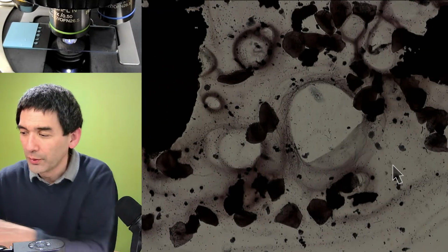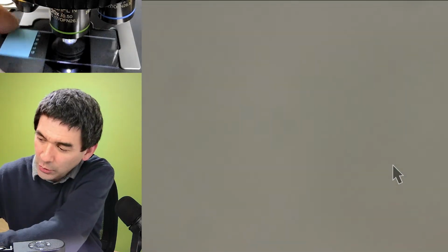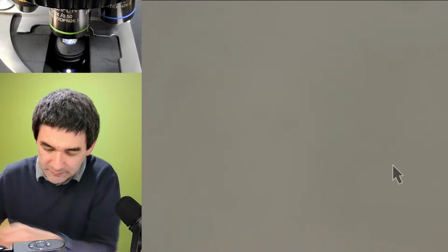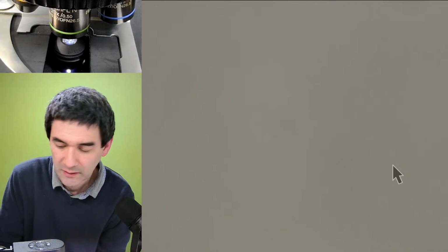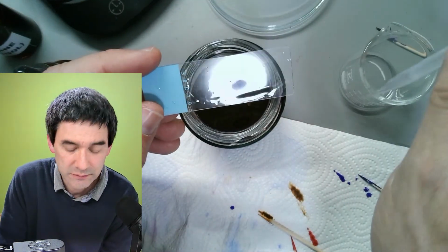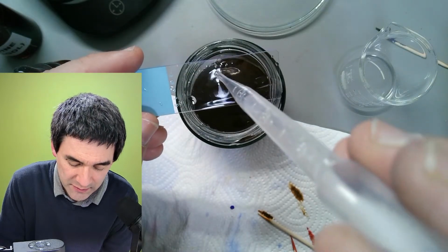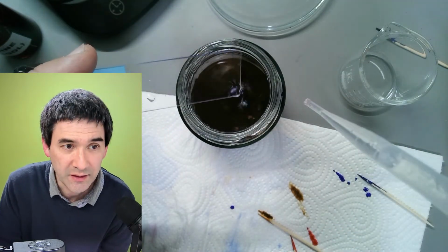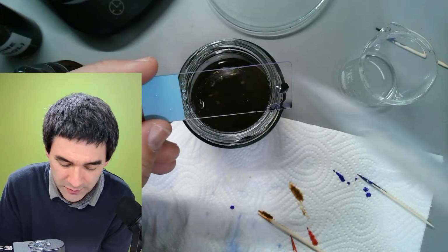Now we're going to start the de-staining by adding the alcohol. I always forget to change the camera. So let's do the same thing again here. Let's try to de-stain. You can actually see now that the blue pigment is coming out.